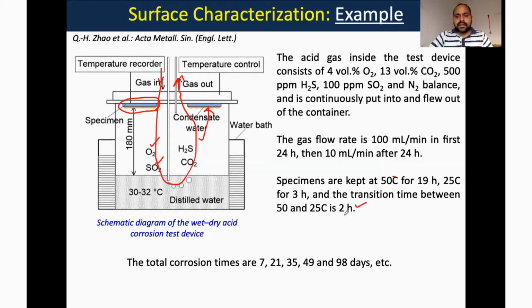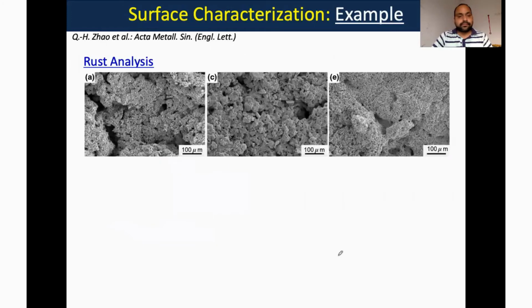And this is the generic setup. Then how long was the sample kept there? They investigated different time intervals: 7 days, 21 days, 35 days, 49 days, and 98 days. Now we can see the output here. There are many other analyses they have reported in this paper. If you are interested, you can follow this reference.